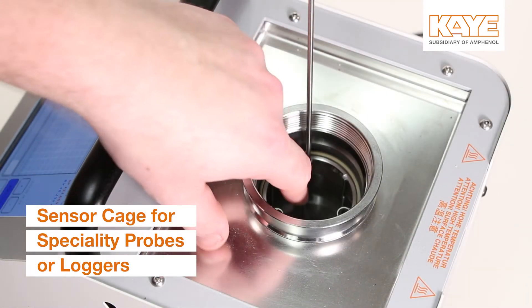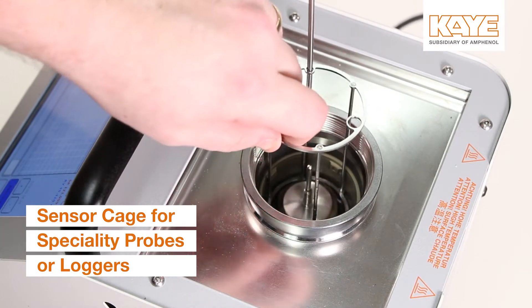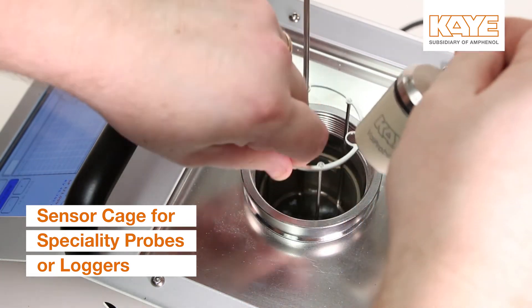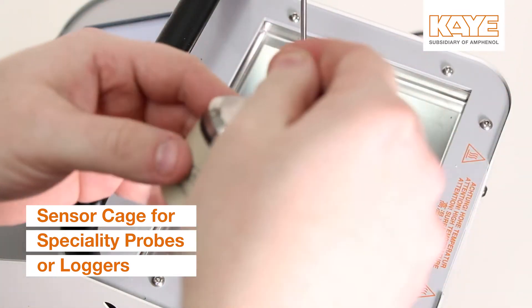The liquid tub insert also includes a sensor cage, which allows for easy inserting and removal of probes, as well as temperature standards such as the K-IRTD.